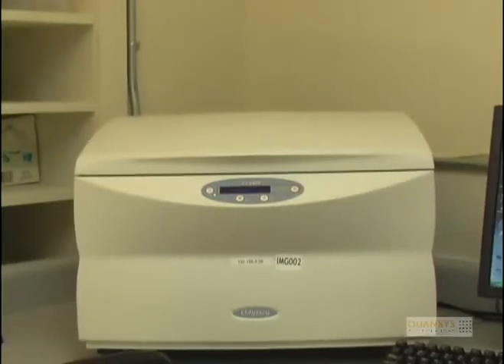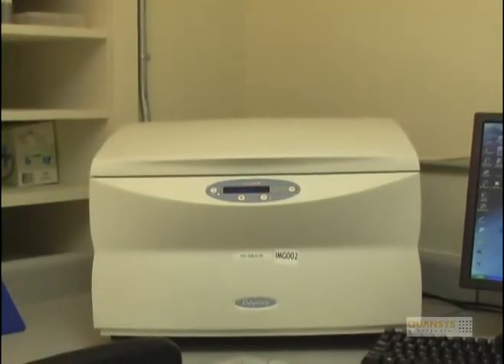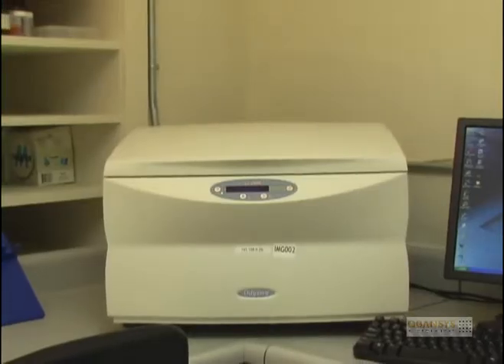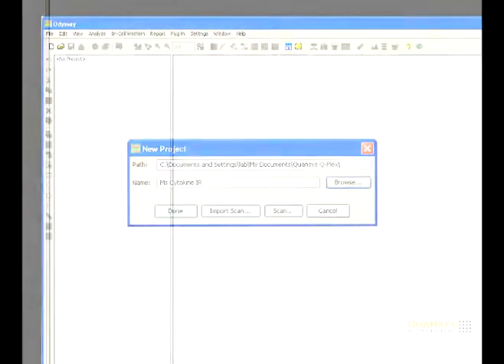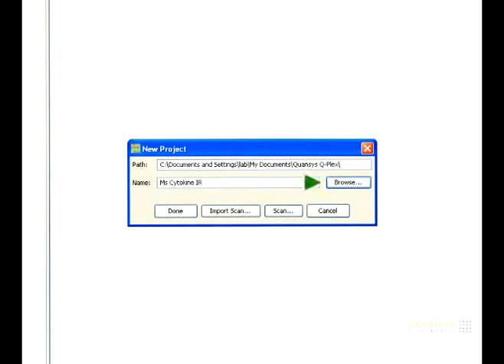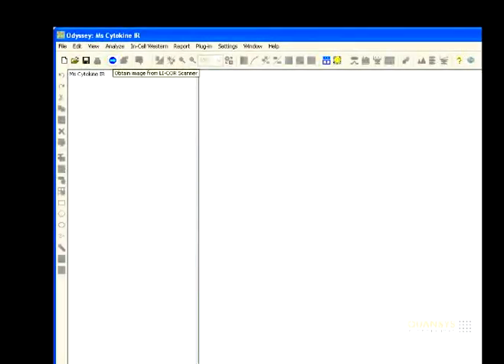Instructions for scanning a Quansys Q-Plex IR assay using the LI-COR Odyssey scanner. Launch the Odyssey software and create a new project. When the new project window opens, browse for the desired save location and enter in a name for the project, then select Done. Once the new project has been created, select the blue scan arrow on the software.